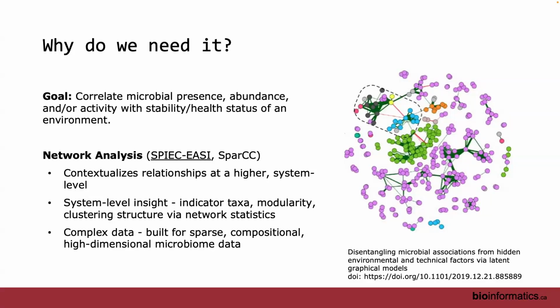They are not clustered, but they are linked together, based on how similar they are, but nothing functional. There's no functional information you can associate, although there are networks that do that. In this particular case, it's using ASV data and abundance information across different types of samples.